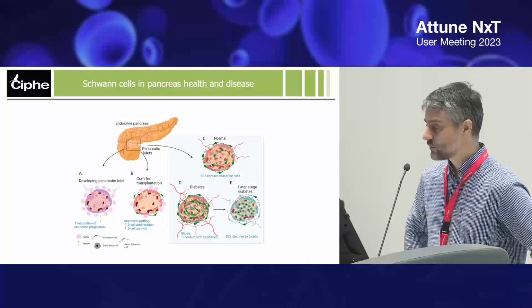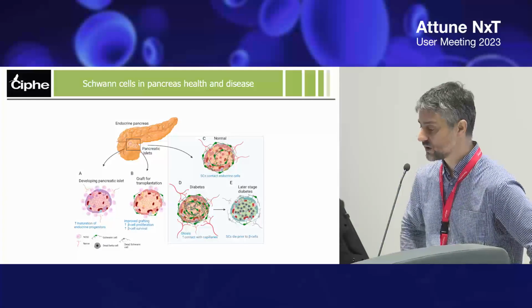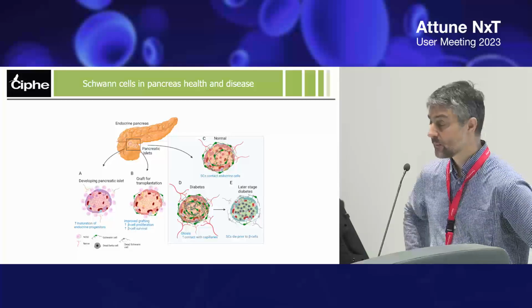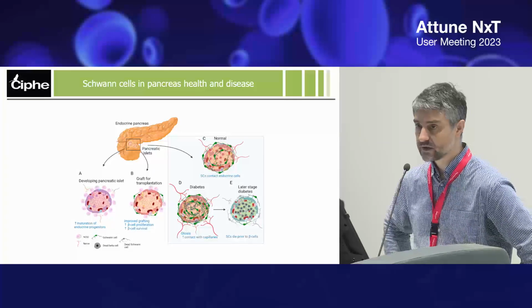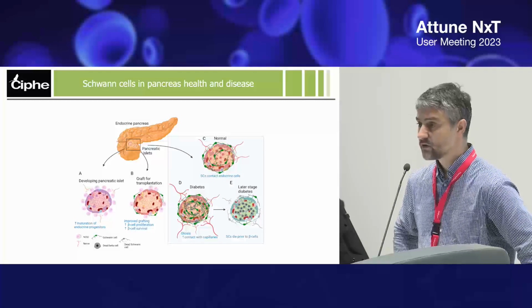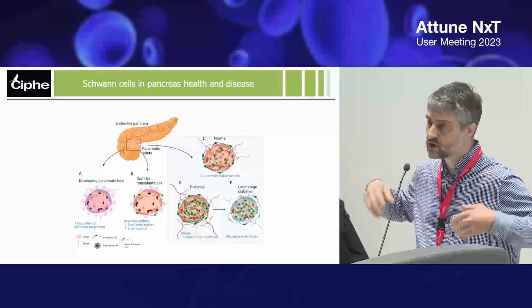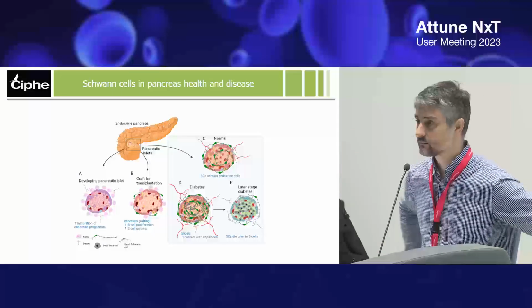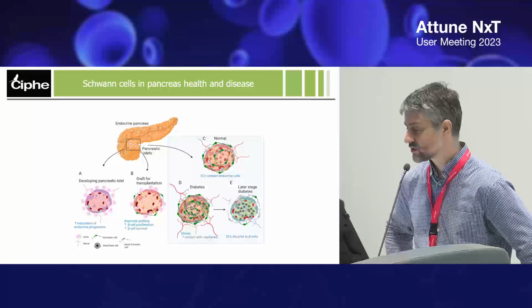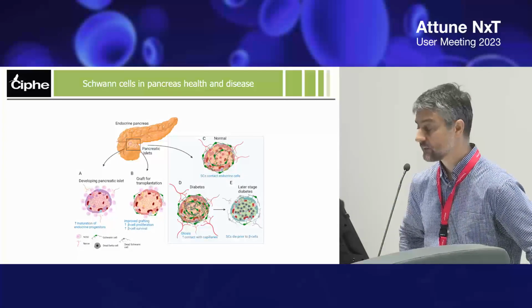But basically, the way we approached the pancreas dissociation was that we got partners that came to us wanting to do single-cell RNA-seq with us, so we do that in the lab. And they said, our extraction procedure is ready, we just need to sort. So, okay, let's try your approach. They also wanted to sort some tricky cells, the Schwann cells.